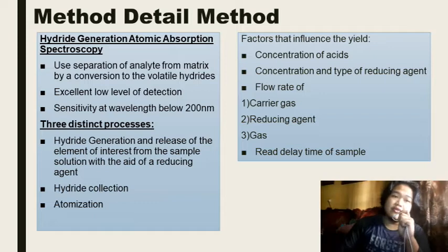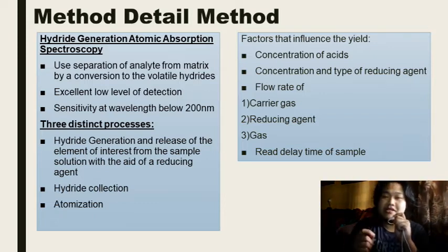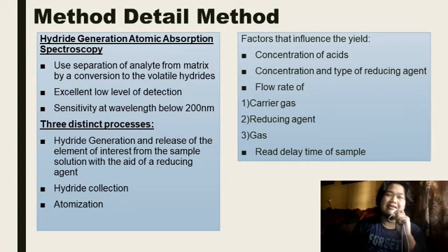So, let's go to hydride generation AAS, atomic absorption spectroscopy. HGAAS uses separation of analyte from matrix by conversion to the volatile hydrides.